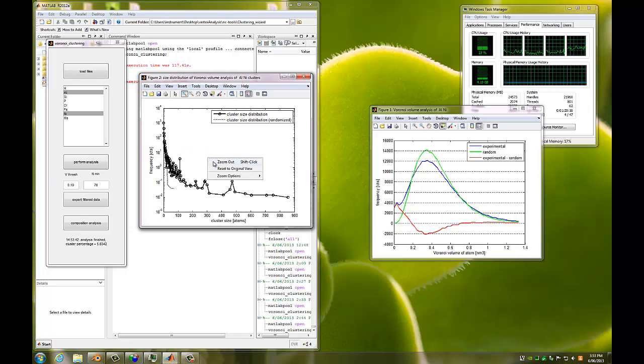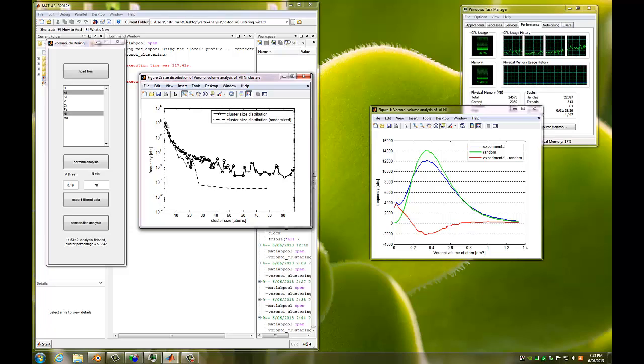Set to original view and horizontal zoom only. So for every cluster there's a bin created, and if there are multiple clusters with the same size, then the frequency is this amount. And if there's only one cluster with a certain size, then we measure how close in size there are other clusters and divide by that amount, so that you can get dynamic binning very easily this way.